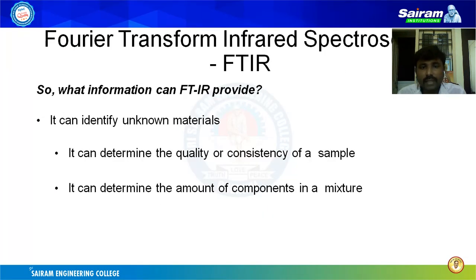So, what information can FTIR provide? It can identify unknown materials, and it can determine the quality or consistency of a sample. It can also determine the amount of components in a mixture.